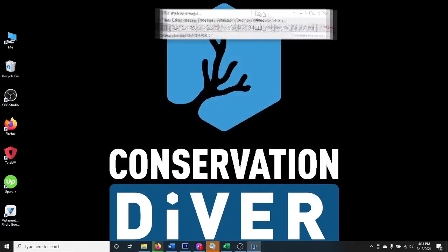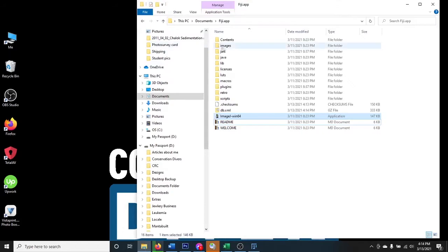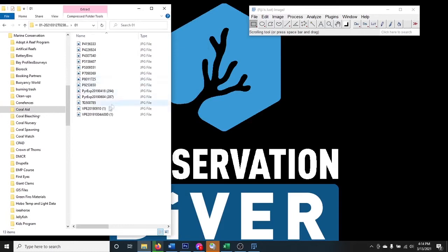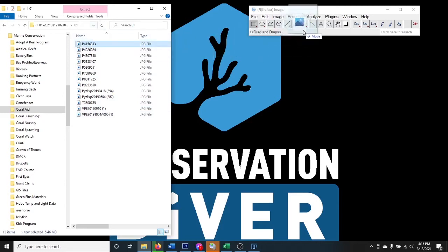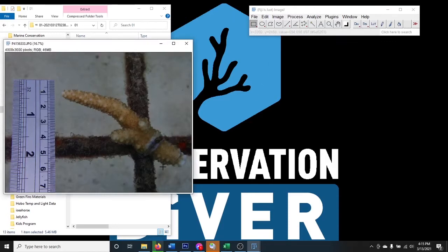With ImageJ open, let's look at how to analyze a picture. You'll need some photos — I have some here from a mineral accretion device project. I have all these photos taken of the same coral on a nursery. I'll take one of those and just drag and drop it into ImageJ to open the photo of the coral.